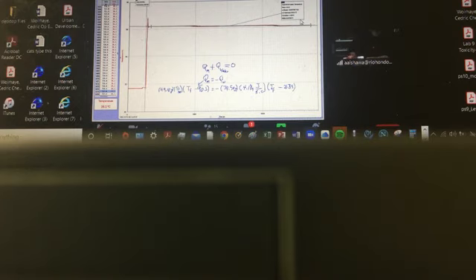This is when I mix the metal with the water. See that little kink? When the temperature starts to spike, starts to jump, that's when I mix the metal with the water. Around that time, can you read the window? Locate the temperature inside that window. So here's the beginning of the mixing of the metal with the water. Can you read that temperature?